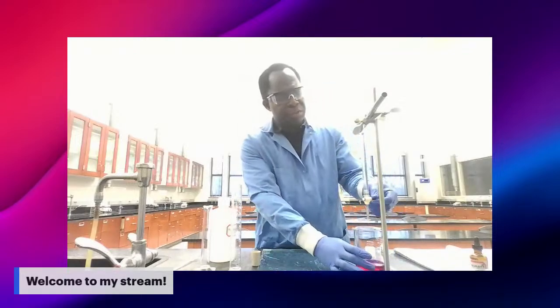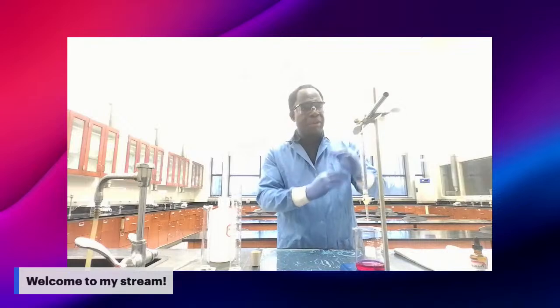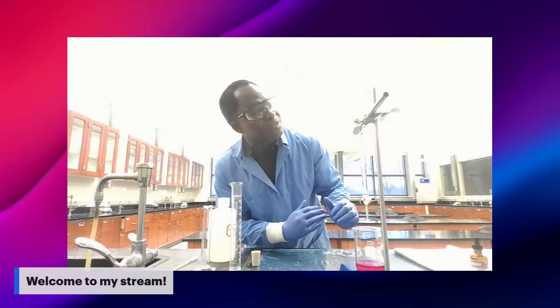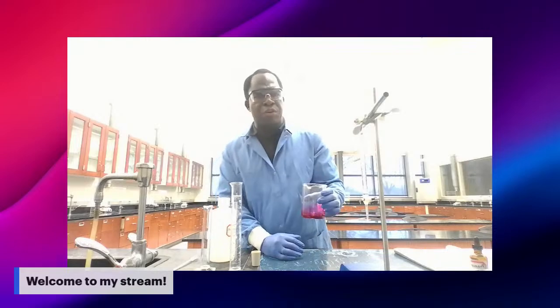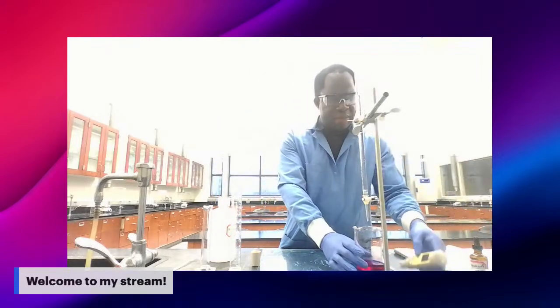As you're going by increments of 1, each time, measure the pH of the solution. When you get to equivalence, I'm getting the color change at around 23, 24. So you're going to measure what happened at that time.